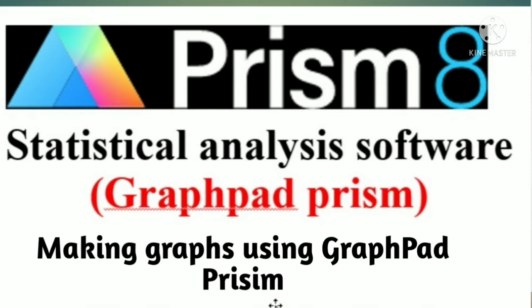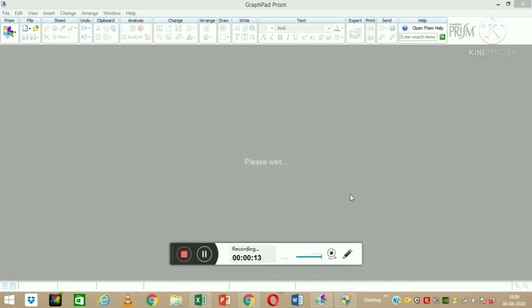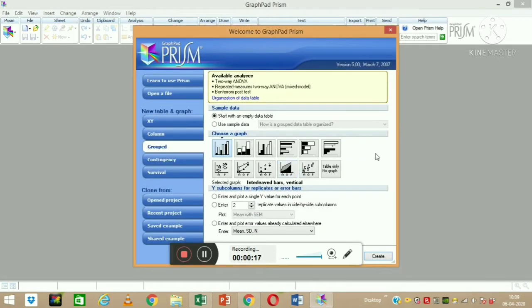Today we are going to discuss how to plot certain graphs and do statistical analysis using GraphPad Prism. As you can see on my desktop, I am now opening the GraphPad Prism software. This is how it will open, and as you can see from this diagram, we can do a large number of graph preparations.